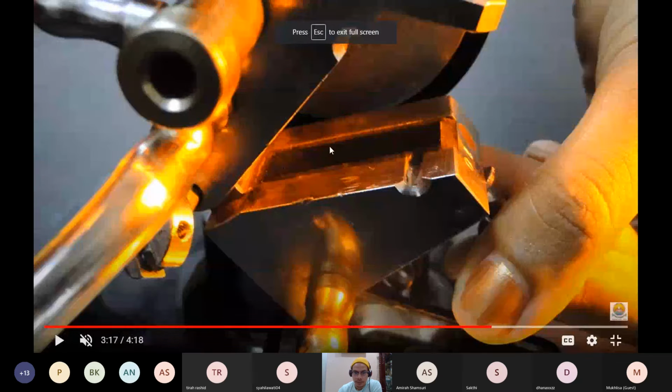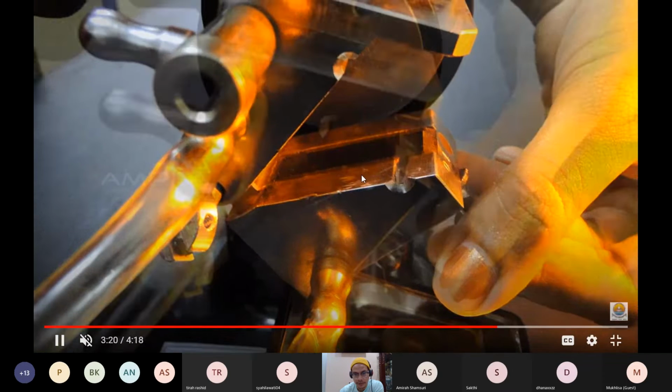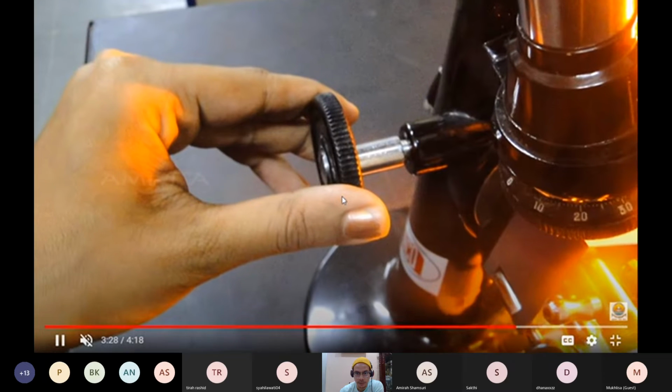Okay, so this is where we place our sample. So kalau kamu ada salbutamol respirator solution, kamu take a few drops, ambil dropper, letak a few drops kat atas ni. Make sure they cover this crystal completely, kemudian tutup. Dekat bawah ni akan ada satu sumber cahaya, so dia akan tembak this crystal and it will pass through the crystal and also our salbutamol solution tadi.